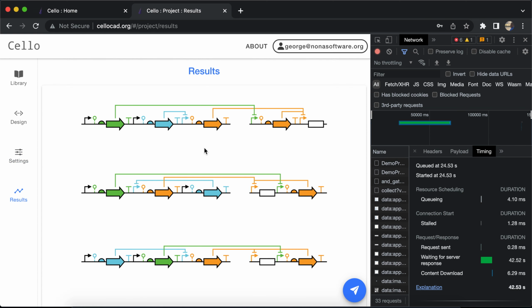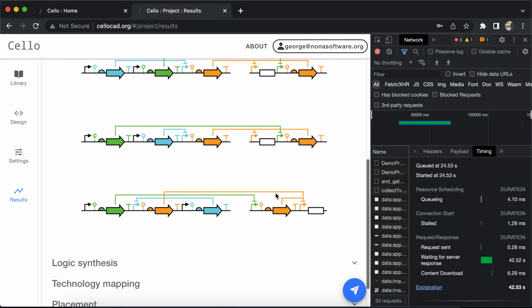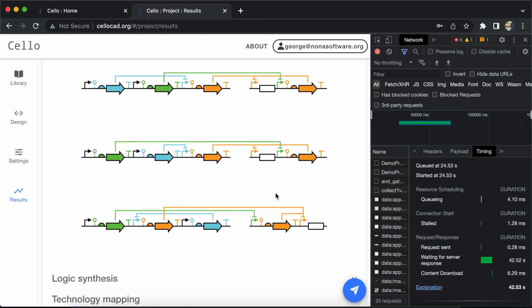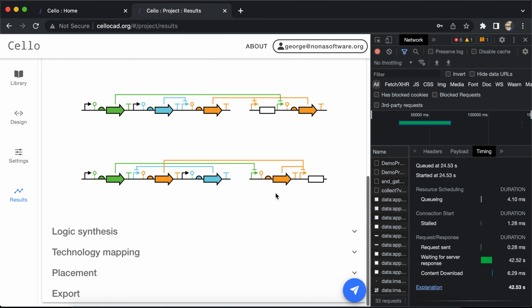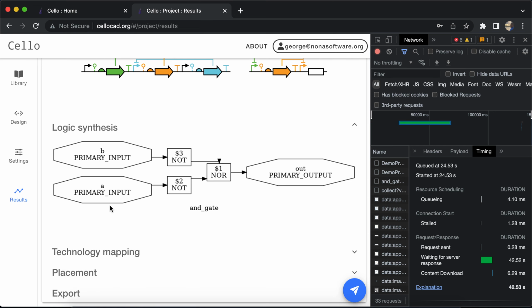We're going to now go into some of the results, where it will show you the same circuit in different ways. So all these are synonymous with each other. They could all be implemented and they could produce different results. This is not real rocket science. This is a little bit more biological, so not everything's down and exact. I believe in the Nature paper, when they tested all the different variations of a circuit, 45 out of 60 produced what would eventually become real logic or real systems functioning as expected, where A and B produced a primary output, for example.